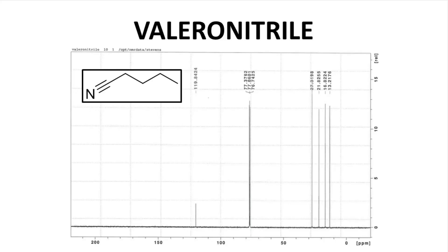Next is a compound called Valeronitrile, which has five carbons, including the nitrile. Again, the solvent is CDCl3 with a signal close to 77 ppm. The four sp3 hybridized carbons have chemical shifts of less than 77 ppm.